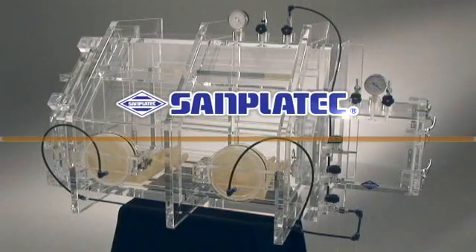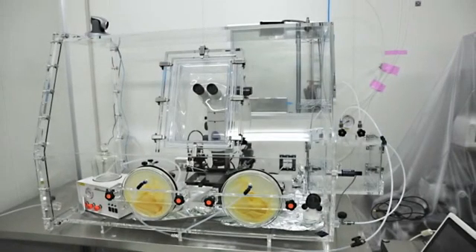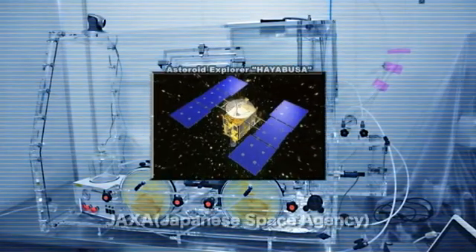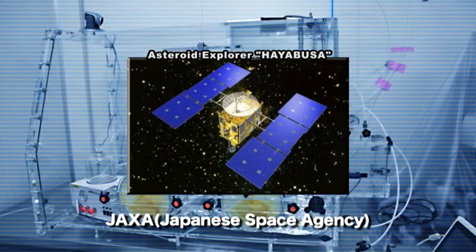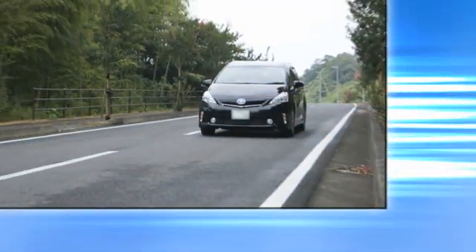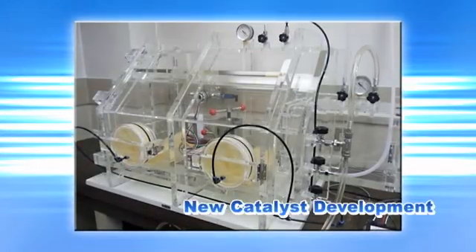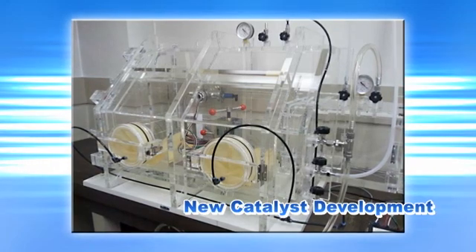This is the Sanplatec Acrylic Vacuum Glovebox. The Sanplatec Vacuum Glovebox is used in the latest research institutions like JAXA, Japanese Space Agency. It is used in lithium battery development and new catalyst development fields, which need a steady environment without external factors such as oxidation, moisture, and dust.